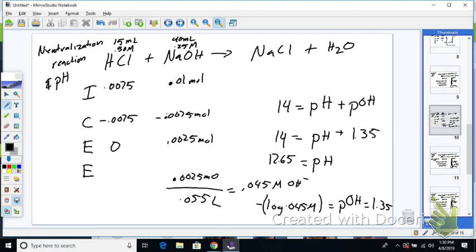Okay, here's another variable, the NaOH. Did I make up that correctly? So when you put it in there, is that really representative of it? It should be pretty close. And then when you're adding, and you don't stop right at 5 milliliters, and you put one or two drops extra or less, that's also going to have a play in your pH and seeing if it correlates or not.